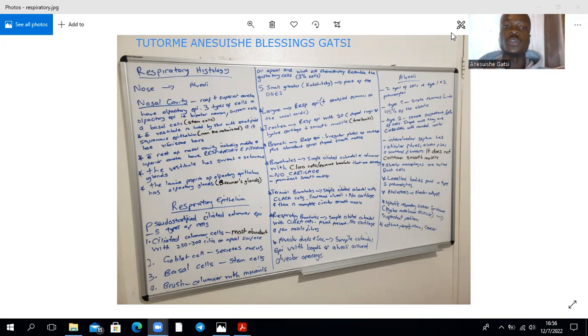The video in focus will be looking at the respiratory system histology. In the first segment, we're going to have a short discussion on what we expect to find in the respiratory system. Then in the last segment, I'm going to show slides and a bit of a description of the slides that are going to be of various structures within the respiratory system.